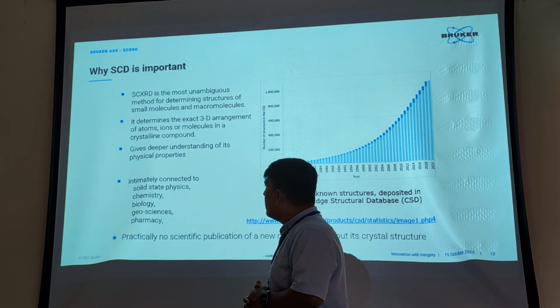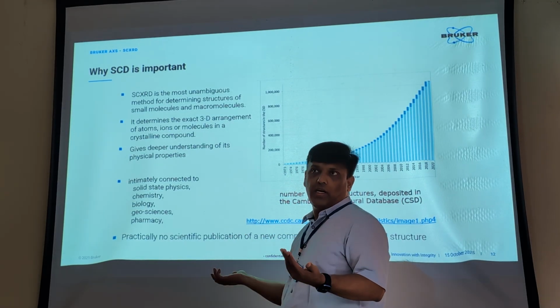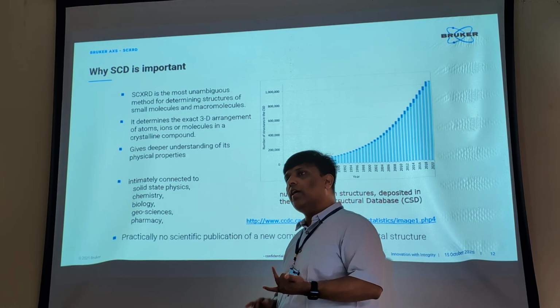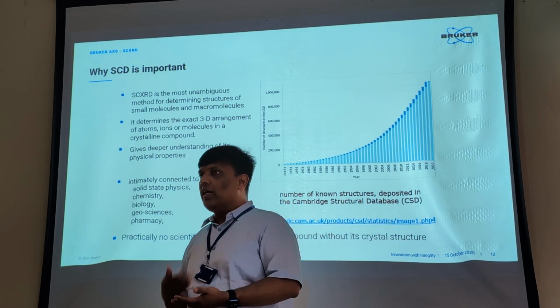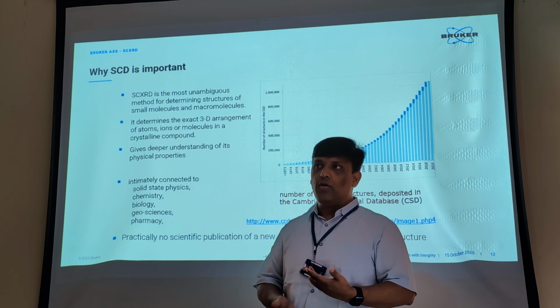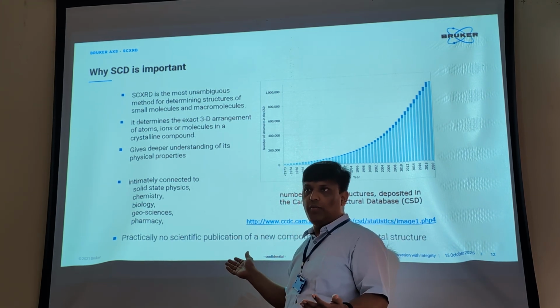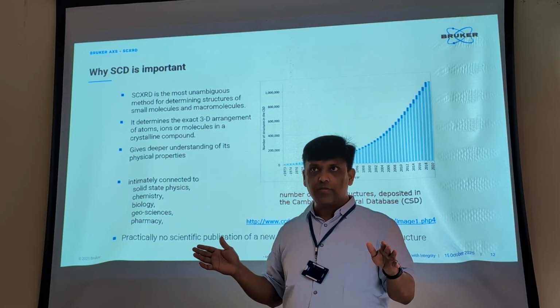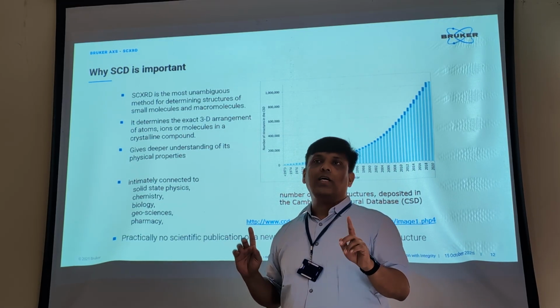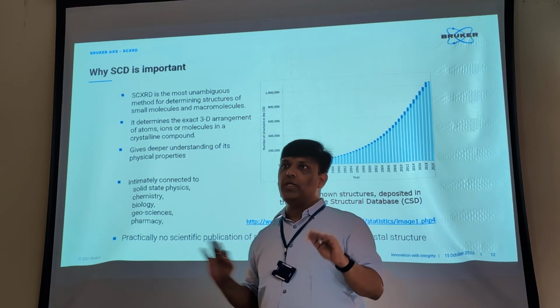So that is the overall procedure, and again, I might be repeating. If you are an organic chemist, an inorganic chemist, a metal organic chemist, a coordination chemist, a natural product researcher, or a bio or protein researcher, everyone can use this single crystal diffractometer to arrive at the structure. There is no limitation on the number of atoms, provided you have a single crystal. Okay, the sample has to be a single crystal.